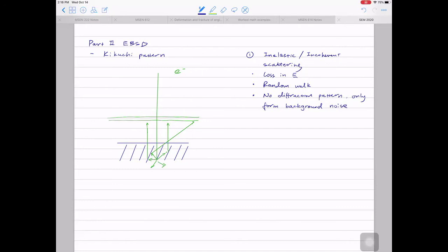The example I can think of is if you go clubbing, you enter the dancing floor, then you just walk around randomly. So this is inelastic scattering. It's incoherent. Let me rephrase. It's kind of like a group of you and your friends walking in the same direction to a nightclub. Then upon entering, you just disperse and dance on the dancing floor. At the beginning you were walking in the same direction, but after entering the dancing floor, you go random. This is the first step.